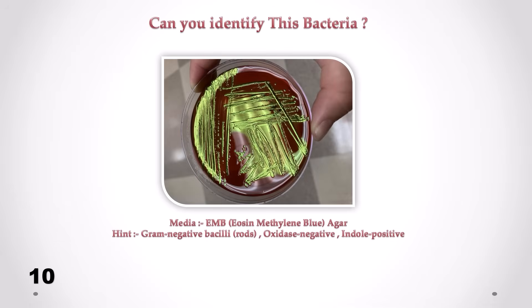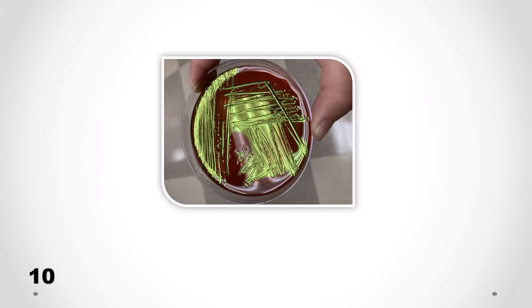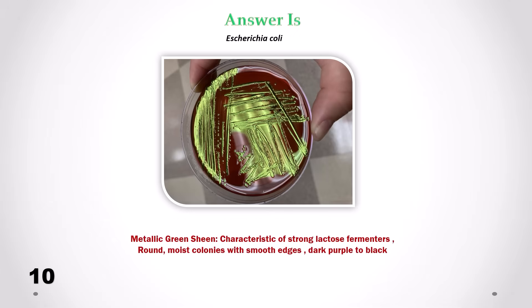Can you identify this bacteria? Correct answer is Escherichia coli. We can see the characteristic metallic green sheen, round moist colonies with smooth edges. Colony color is dark purple to black.